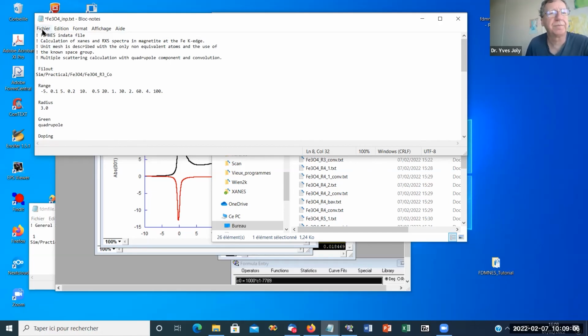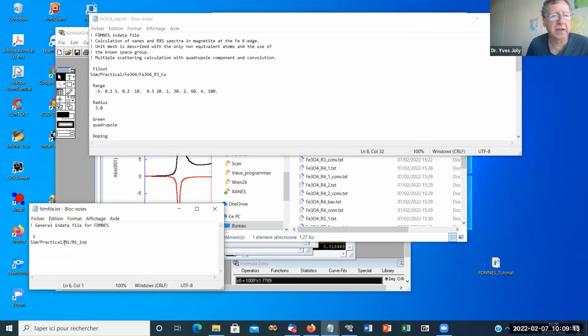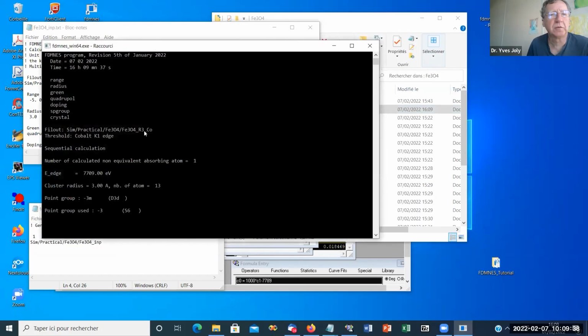That's it. I save. I go back here. I save. We run. So it's a good one.